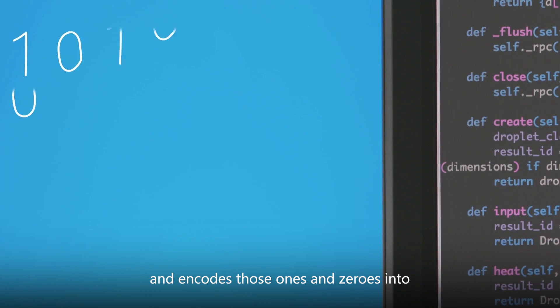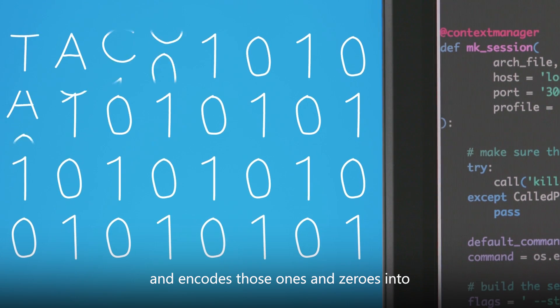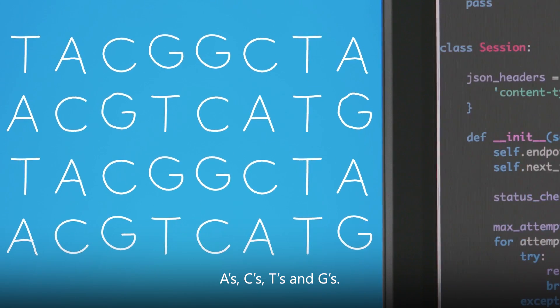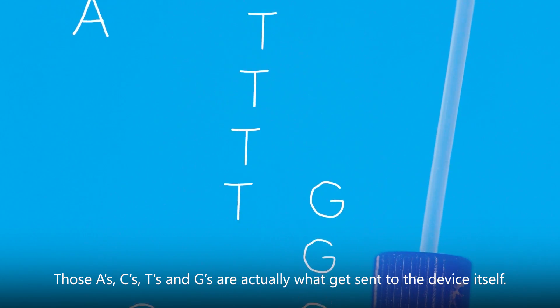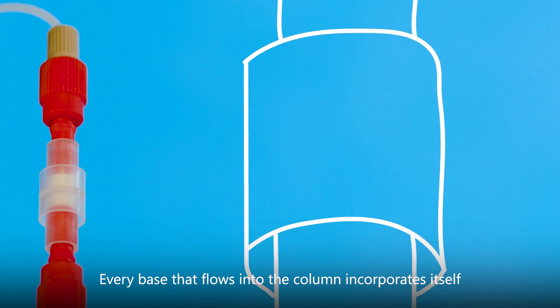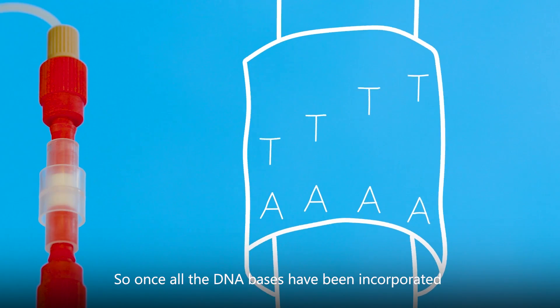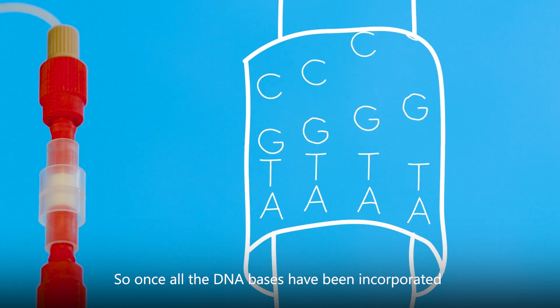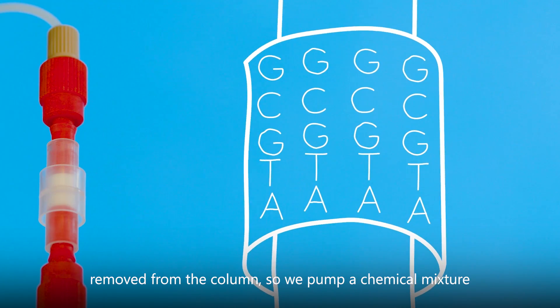The writing process takes your data file and encodes those ones and zeros into A, C, T, and Gs. Those A, C, T, and Gs are actually what gets sent to the device itself. Every base that flows into the column incorporates itself onto a strand of DNA. So once all the DNA bases have been incorporated into the strands on the column, the strands need to be removed from the column.